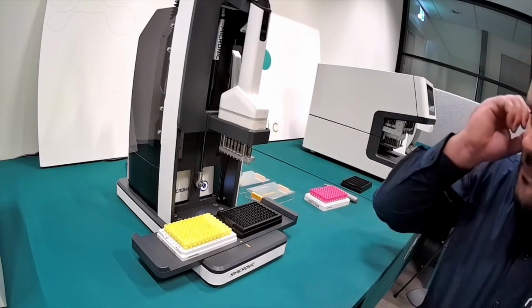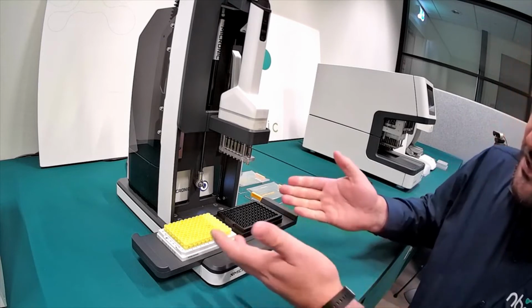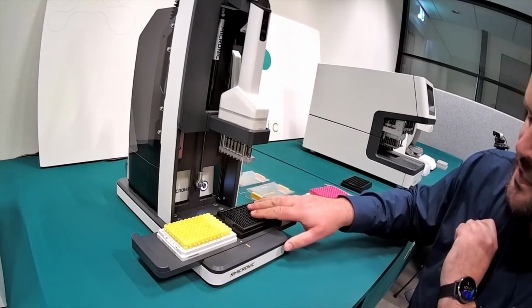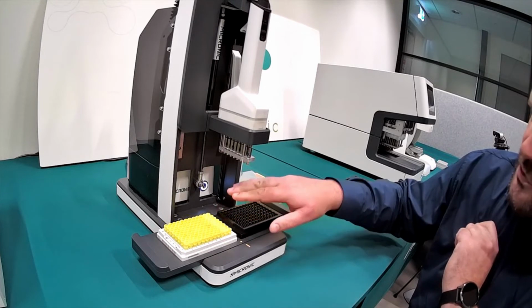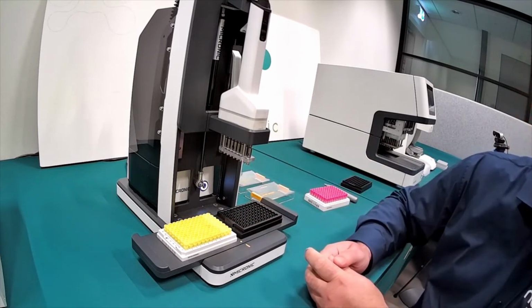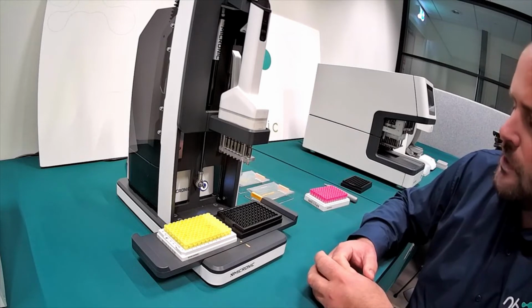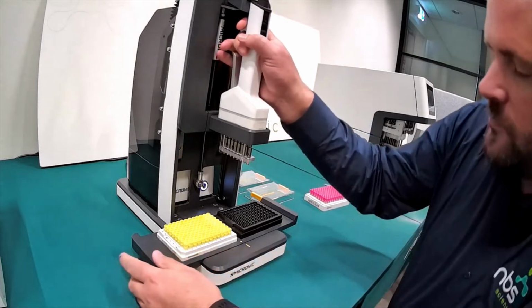This is a decapper and capper for a row of 8. What you see here is a platform. First we have our tubes over here, and over here this is the cap carrier. You can load the unscrewed caps onto the cap carrier, so you will be sure that you won't have mixing of the caps with the tubes from positions. Okay, give me a demonstration of this.